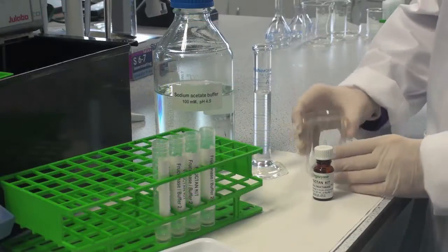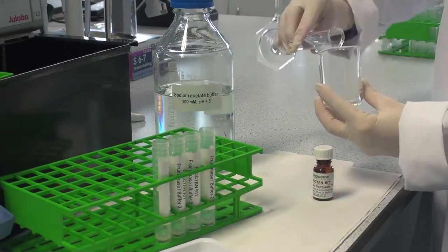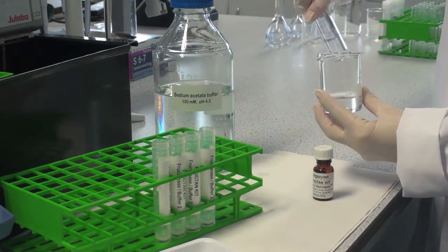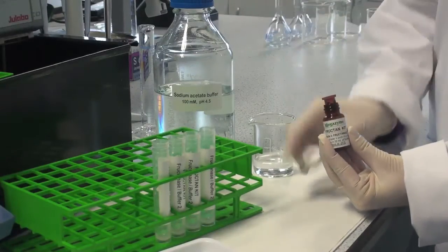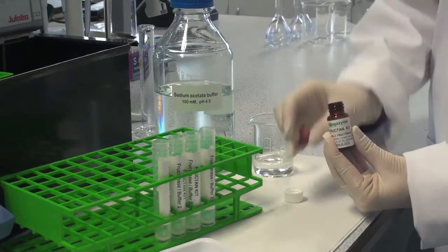Dissolve the contents of vial 2, the fructanase enzyme mixture, in 22 mls of buffer 2, sodium acetate buffer 100 millimolar pH 4.5. This is enzyme solution B.